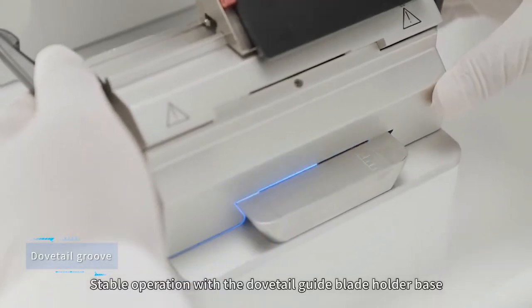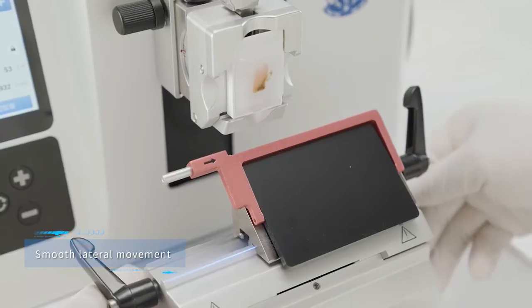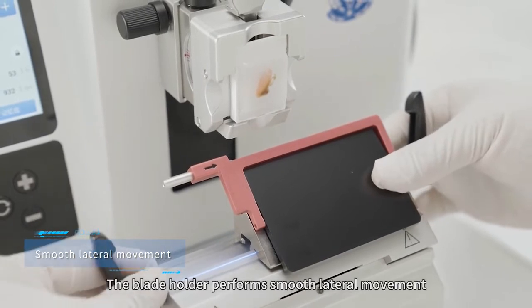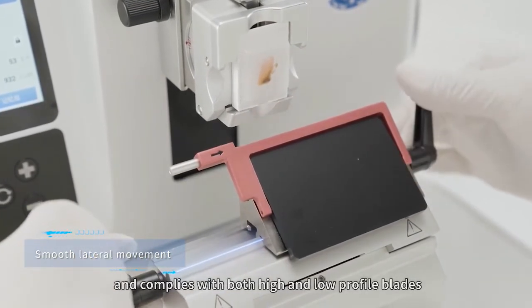Stable operation is ensured with the dovetail guide blade holder base. The blade holder performs smooth lateral movement and complies with both high and low profile blades.